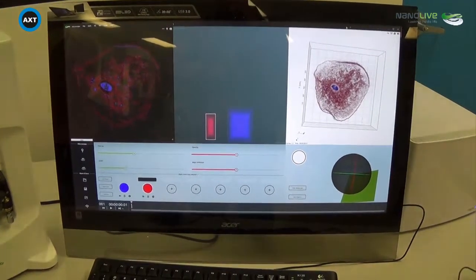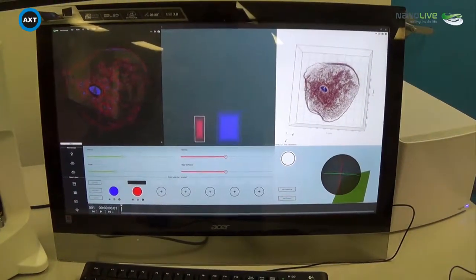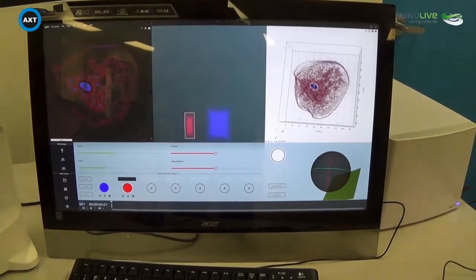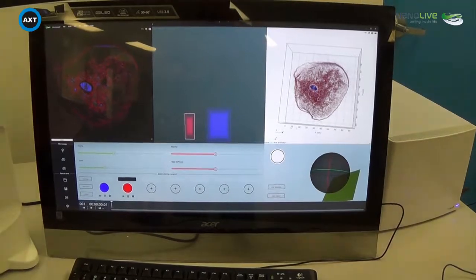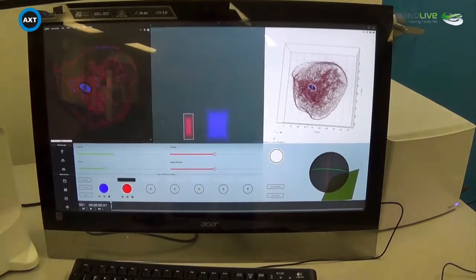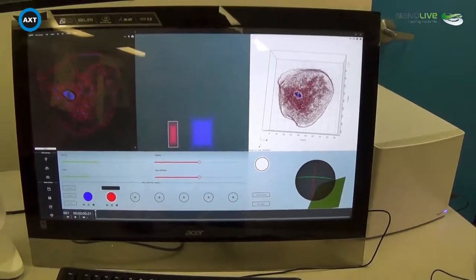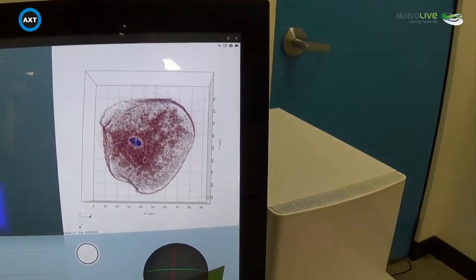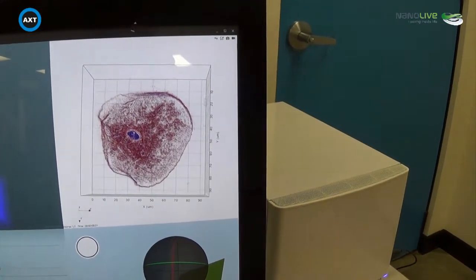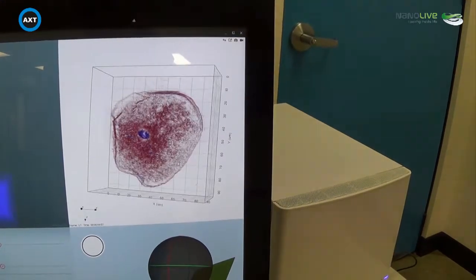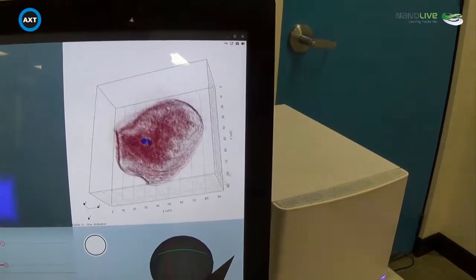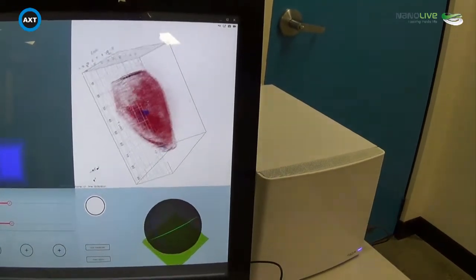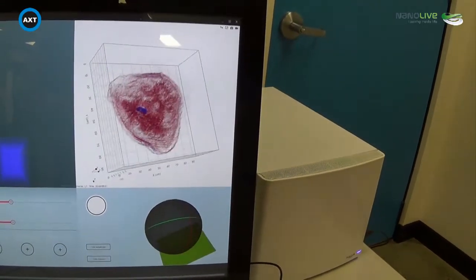If we go back to our 3D view, we're also able to see some measurements in terms of the X and Y values for the cell. So if we look at this one, we can see that this cell is around about 70 microns in the X direction and it's around 75 to 80 microns in the Y direction. So we're able to adjust this view and really see those curls, see the round shape of the cell, see that it's not completely flat, it has some structure to it.